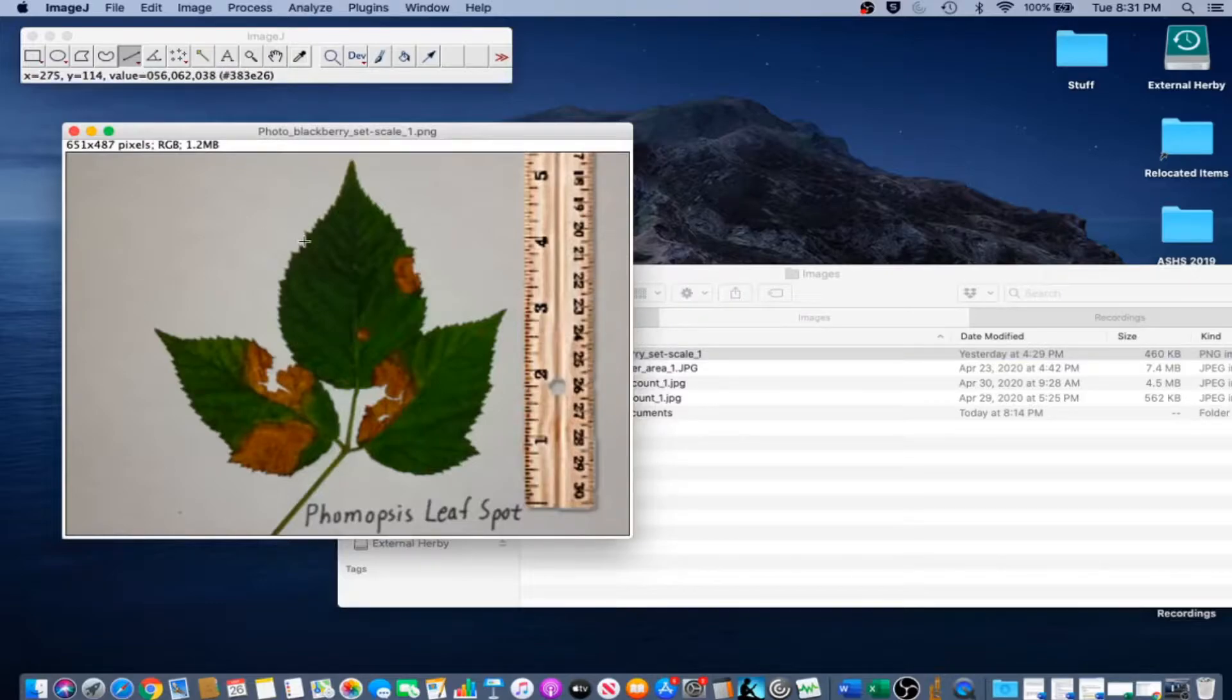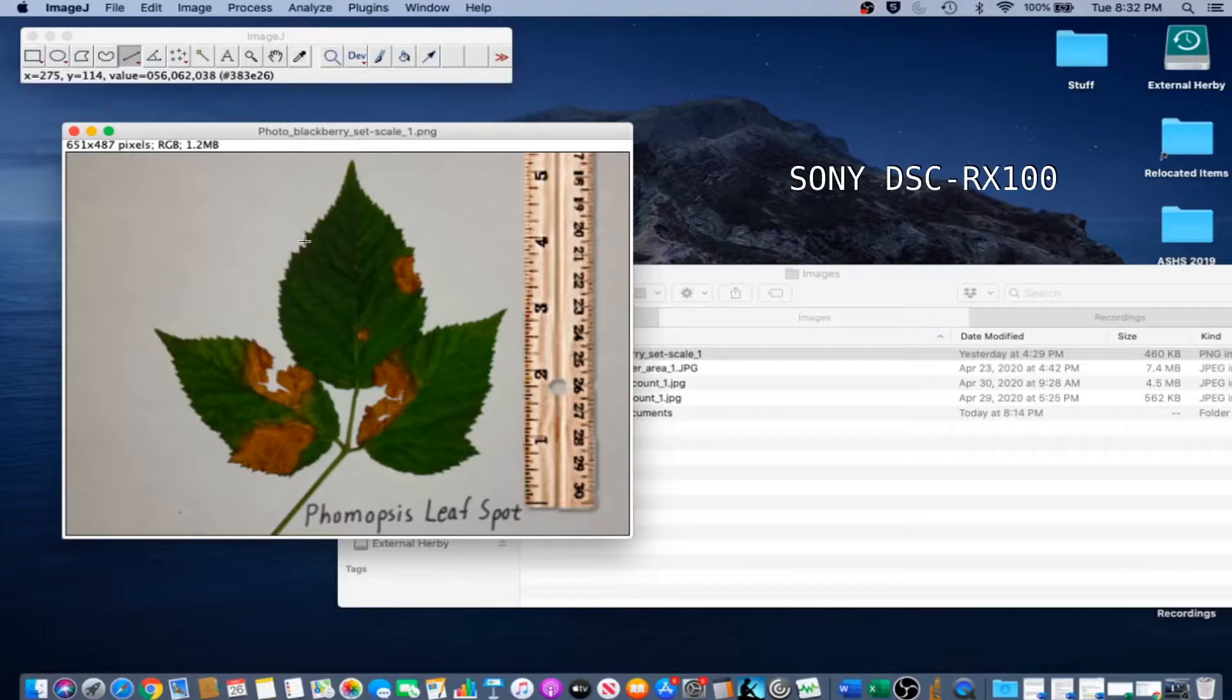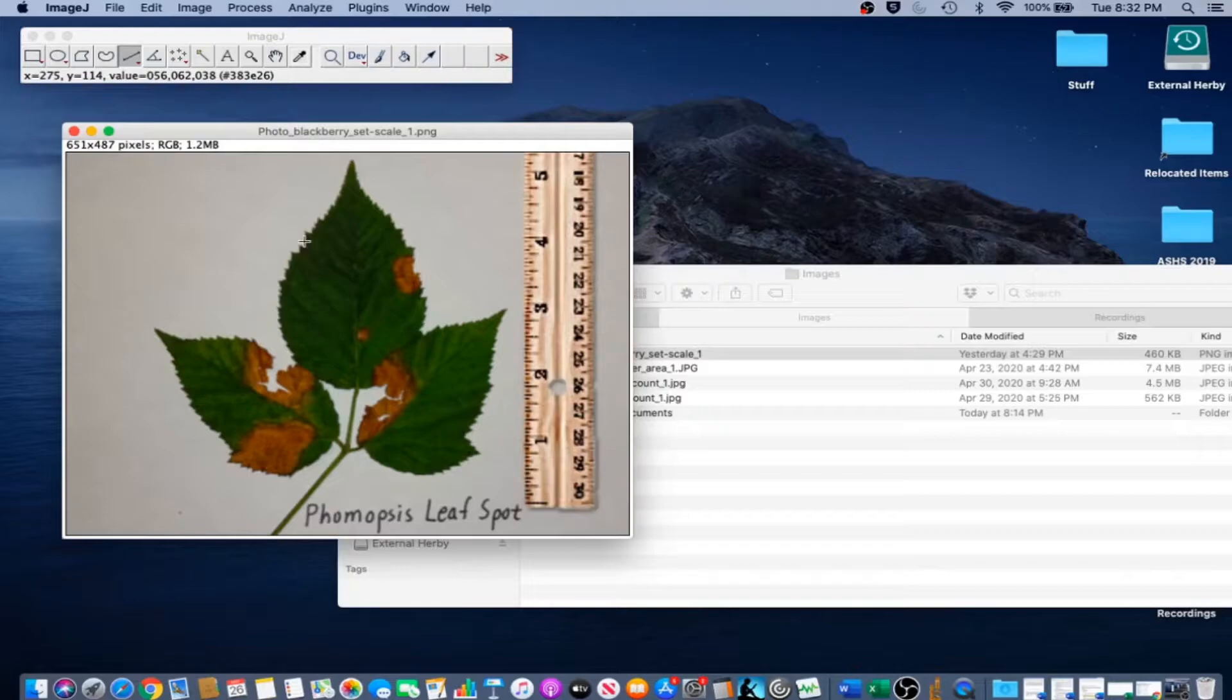Our first example for setting scale in this case is a photograph. This is a photograph of blackberry leaves laid flat on a piece of white copy paper. It was taken with a Sony DSC RX100 compact digital camera in a room with only ceiling lights.